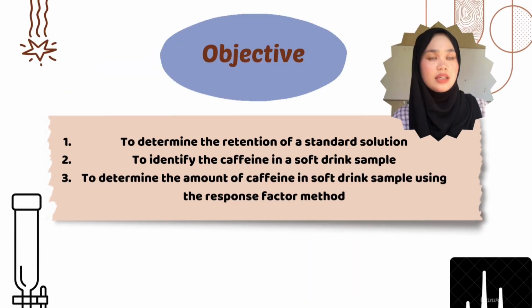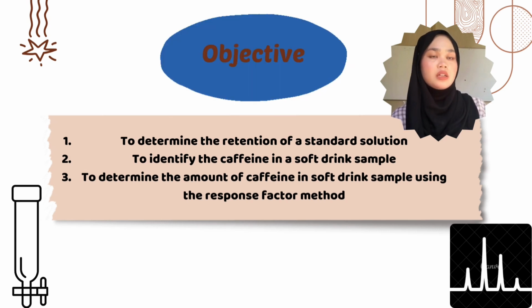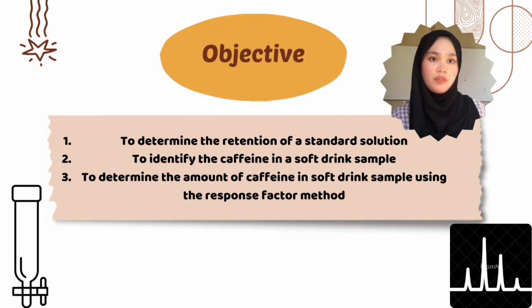Then this is our objective for our experiment: to determine the retention time of a standard solution, to identify caffeine in the soft drink sample, and last, to determine the amount of caffeine in the soft drink sample using the response factor method.